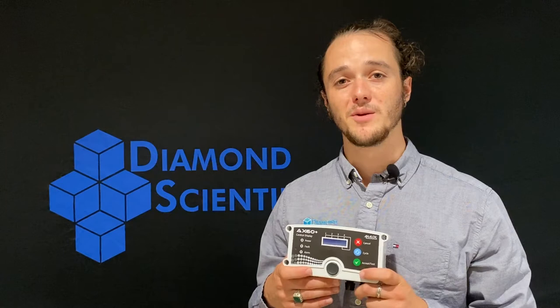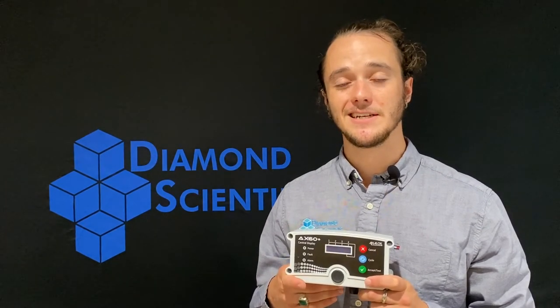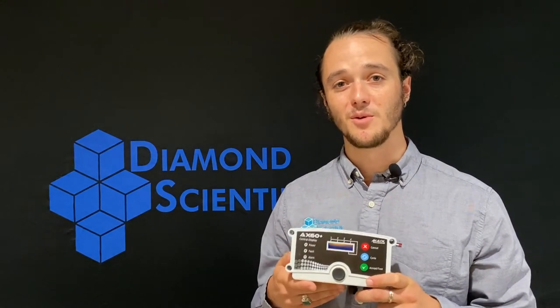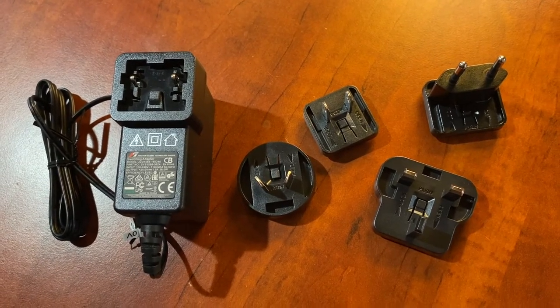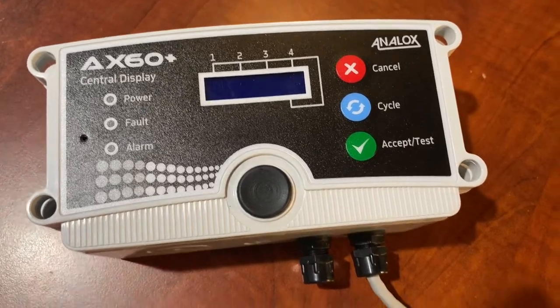From the AP1 package, the first component we'll be covering is the central display unit. This central unit has its own high-resolution digital display and comes equipped to hook up to the universal power supply kit that is included with the package. Along with that, it has its own two-meter length of CAT5 cable.